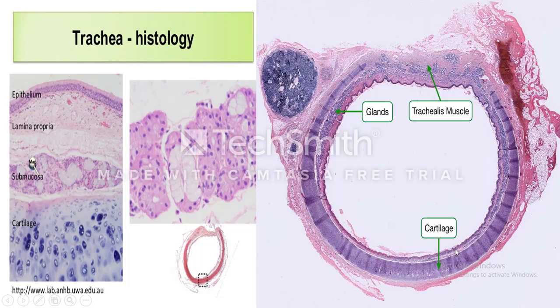This is the trachea. You see an open lumen held by this hyaline cartilage. Okay, this is a cross section of the trachea, which consists of mucosa, submucosa, and adventitia. This is a lymph follicle. Okay, this is the light microscopic structure of the trachea.